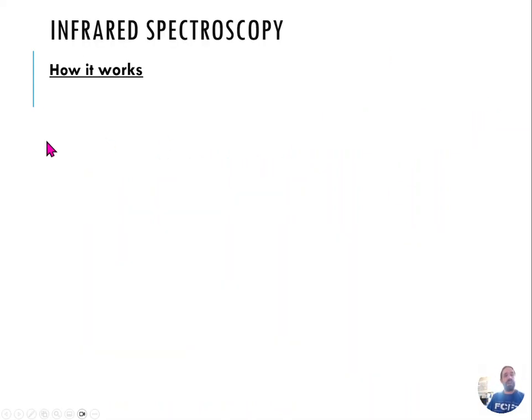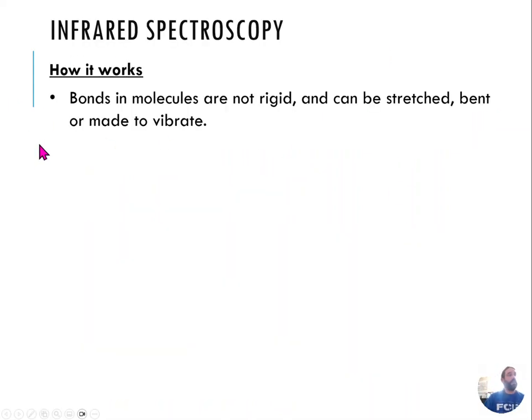All right, so let's first talk about infrared. Infrared spectroscopy works on the principle that bonds in molecules are not rigid and can be stretched or bent and made to vibrate.